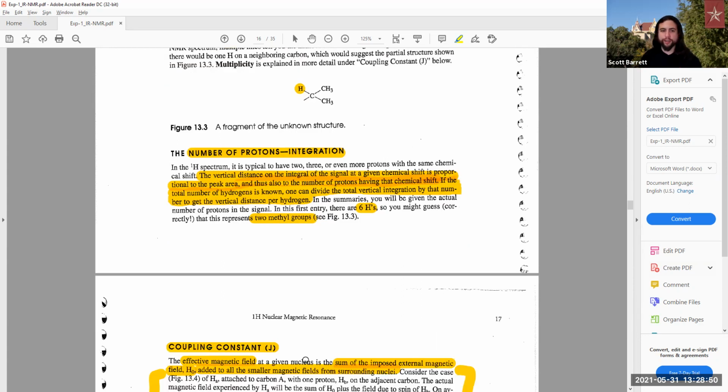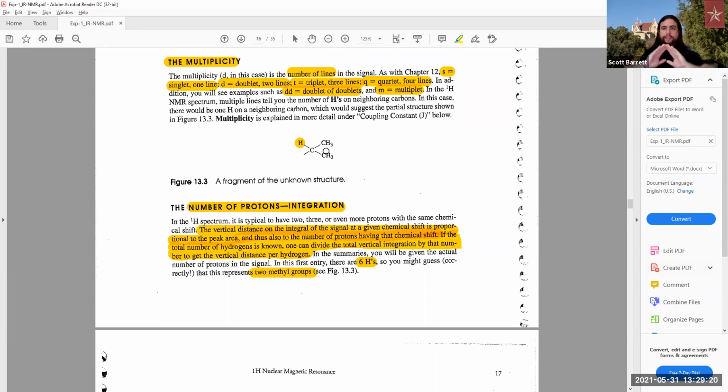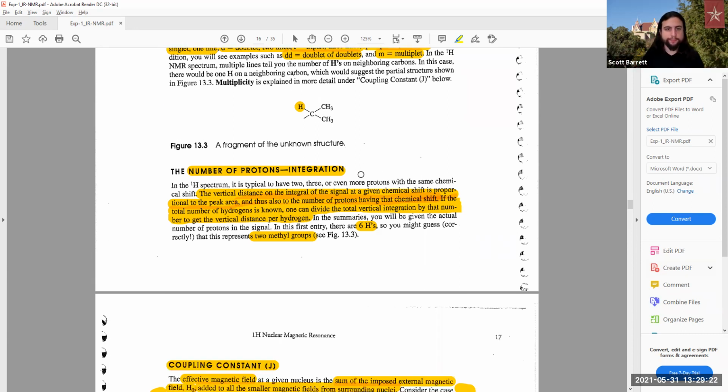It's a little bit easier to understand going forward when we look at broader examples, and then I'll delve deeper into those multiplets. But just know that multiplicity is relative to the adjacent carbons and how many neighboring protons there are. So if there's no neighboring protons, you just have carbons attached and then that's it. Then singlet, that's it. You're only accounting for your proton specifically. No neighboring atoms, singlet. And then you go from there depending on how many you have. So singlet is your base 0 in that case.